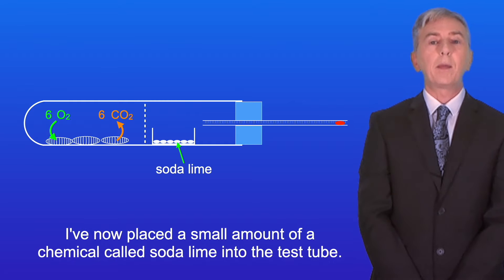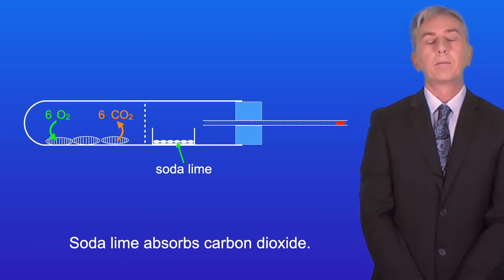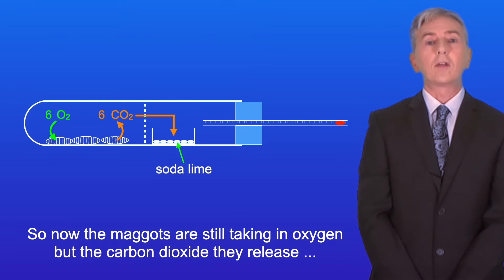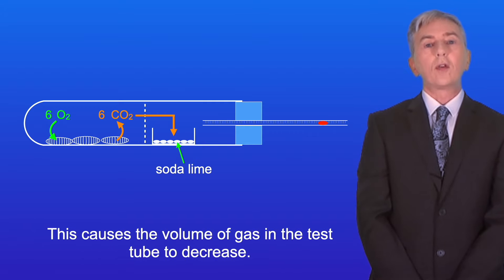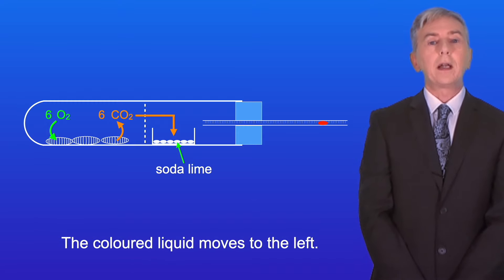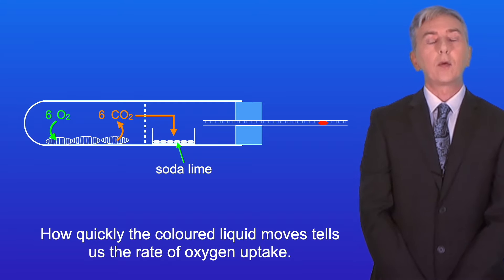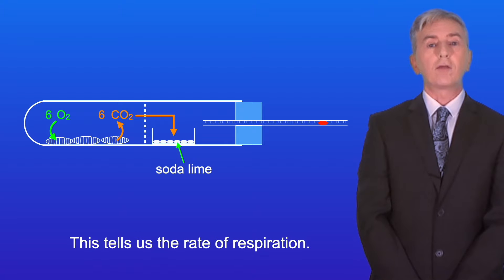I've now placed a small amount of a chemical called soda lime into the test tube. Soda lime absorbs carbon dioxide. So now the maggots are still taking in oxygen but the carbon dioxide they release is being absorbed by the soda lime. This causes the volume of gas in the test tube to decrease and the coloured liquid moves to the left. How quickly the coloured liquid moves tells us the rate of oxygen uptake, and this tells us the rate of respiration.